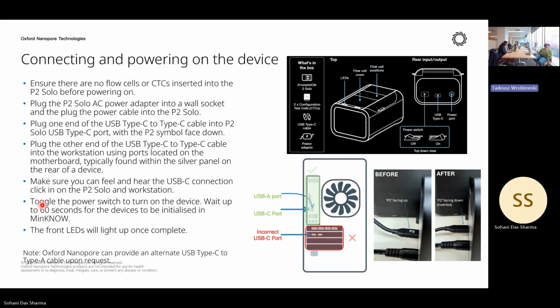I think I already shared the slide deck with you, but I'm going to do it once again today. Another main criterion is, once the system is on, just wait for a minute. We need to make sure the entire platform is initialized properly, and the LED should light up once complete, and that would be the indication that it's working well.